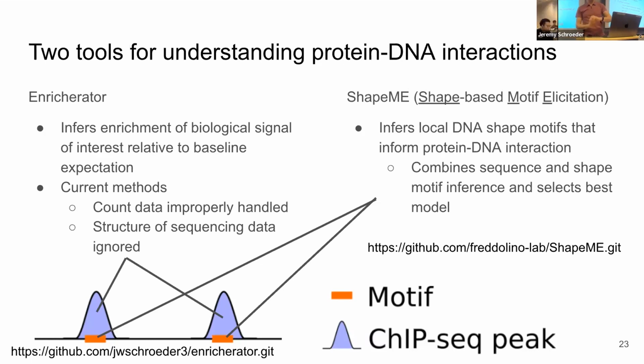Mitch. So for your prior distribution for the alpha vector, you said you had a variance of 4, right? Is that hard coded into all the models, or is that supported by literature, or is there any hyperparameter tuning for that? Yeah, that's a good question. So Mitch asked about basically the choice of prior on alpha, essentially DNA abundance relative to library size, which is what that prior really represents.